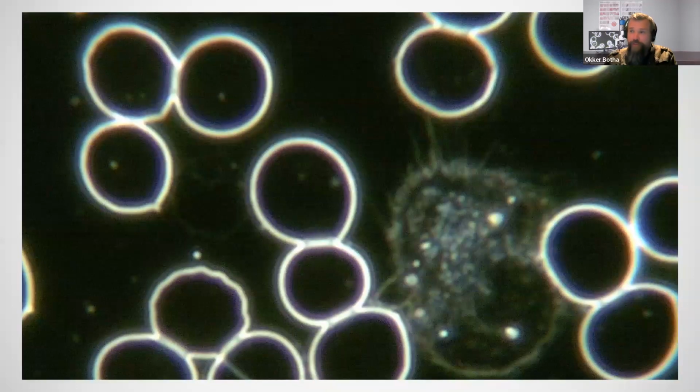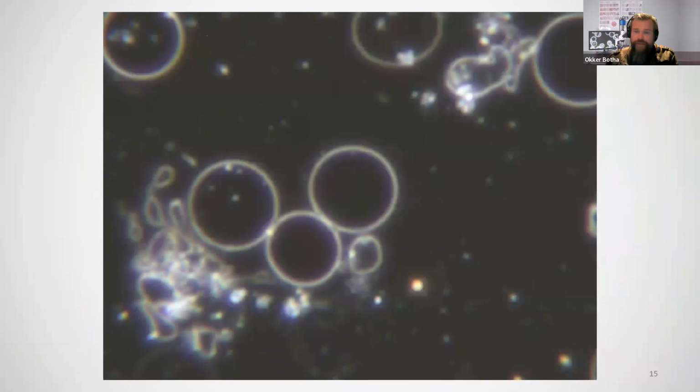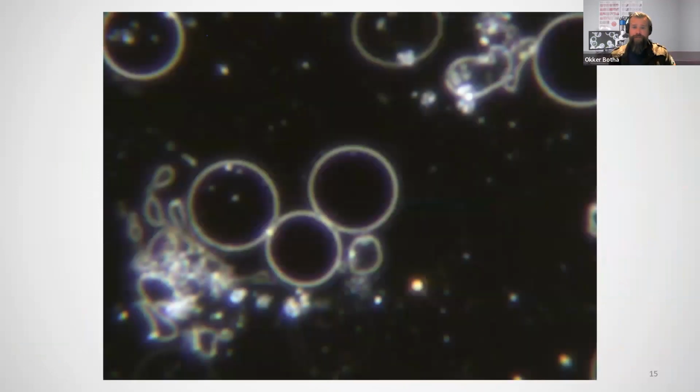I think I have one more. There's also another white blood cell. This is a monocyte. Also 4,000 times magnification using the 100 times objective, and you can see these extensions from this white blood cell as well. I think this is the final image. Just again, the 100 times magnification, and some of the pleomorphic forms that we often look for in dark field as well. So you can see these quite clearly there, and this is with the 100 times objective.